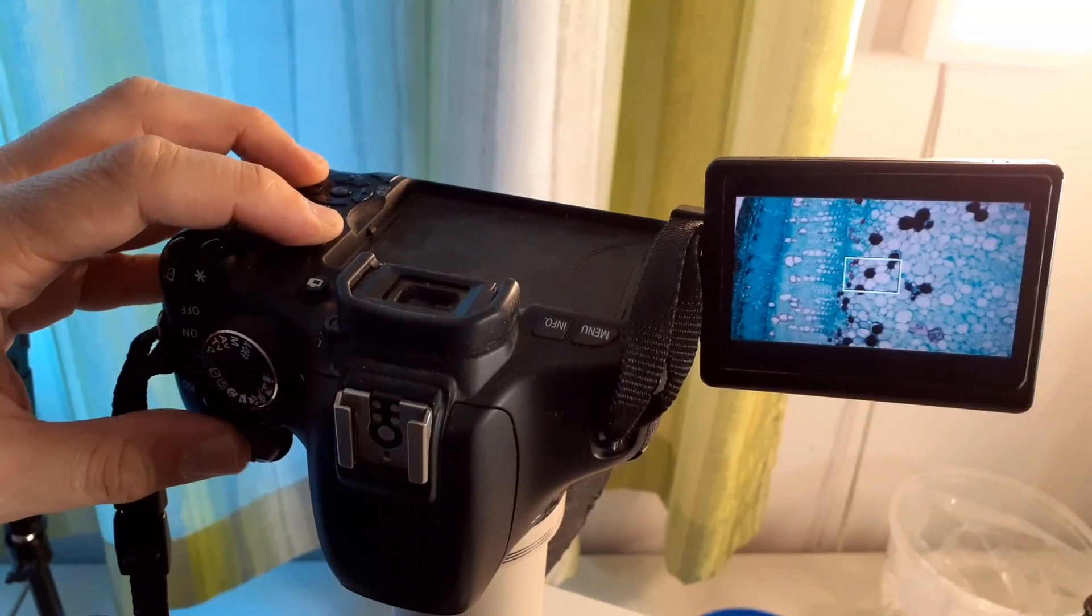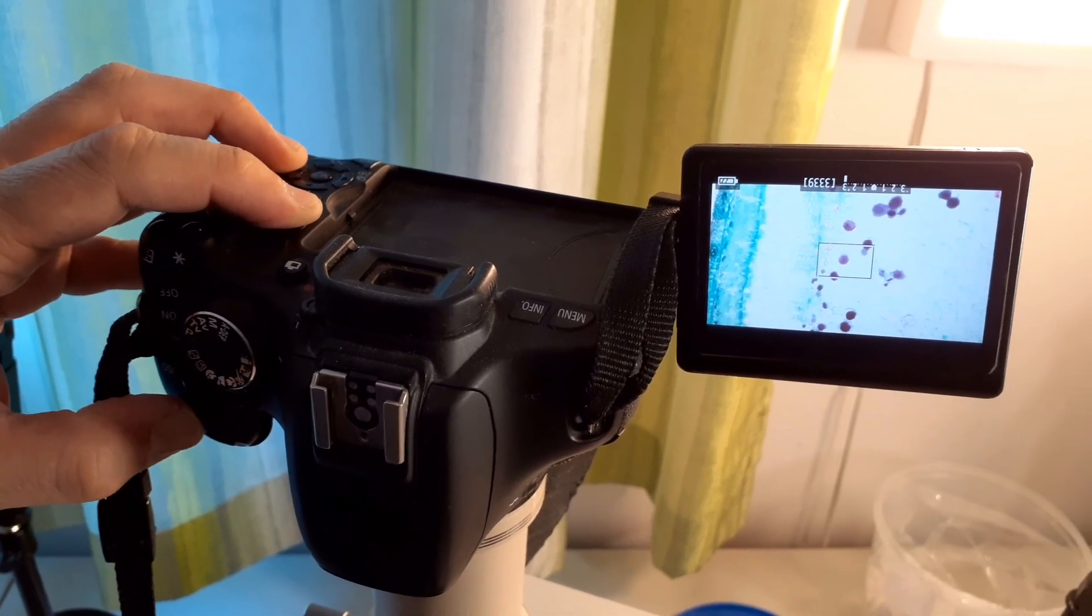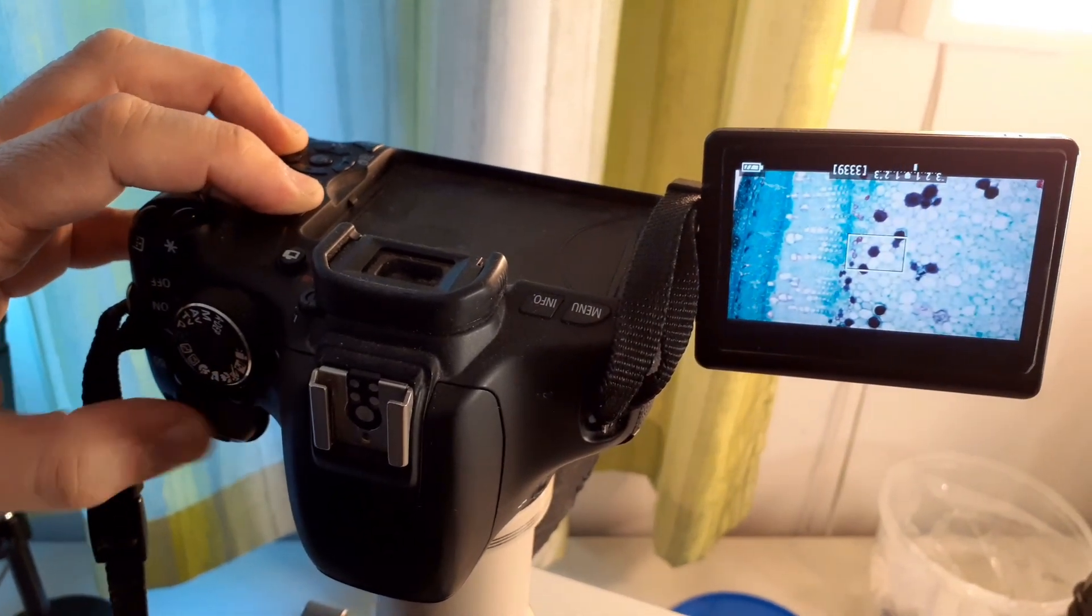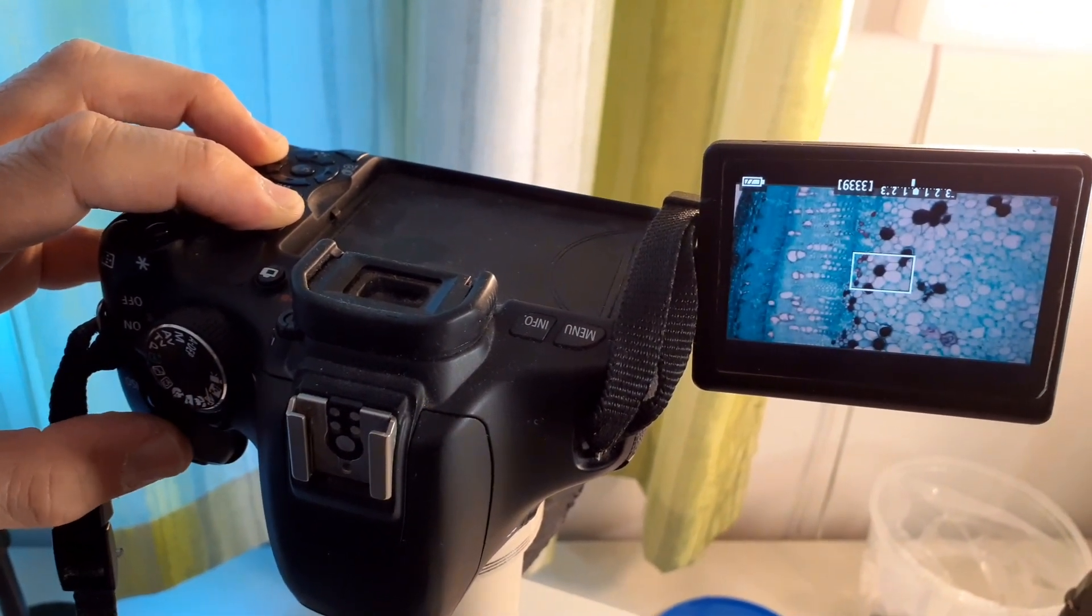Now what about the DSLR cameras? The DSLR cameras, you can make all of the adjustments also directly on the camera. But when I control my exposure, I just rotate a wheel and then I can adjust exposure. But using those microscope cameras, you actually get a full menu. This can be an advantage or disadvantage. It's also a question of personal preference. I think that because I myself am taking a lot of pictures using the camera, what I do is I quickly just sit down here and then just reach up and do all of the exposure controls because I already know which buttons and which wheels I have to press. I can do it directly sitting down, and this is of course a huge advantage using the DSLR cameras.